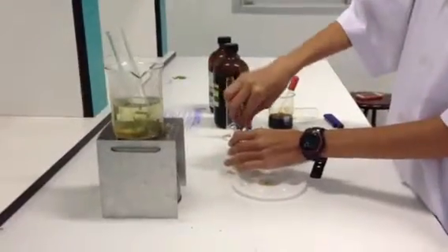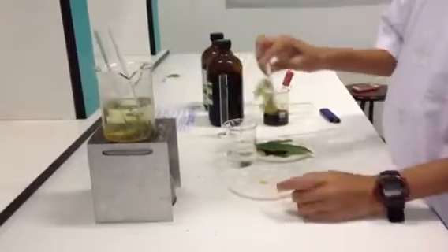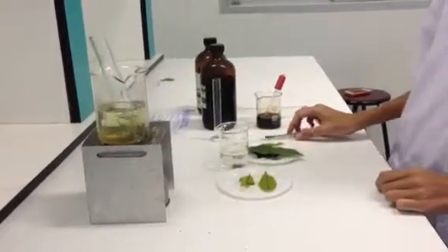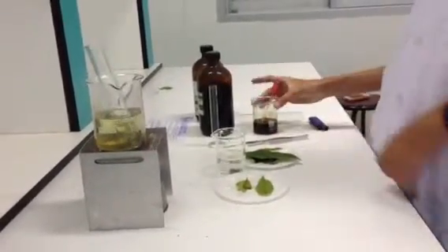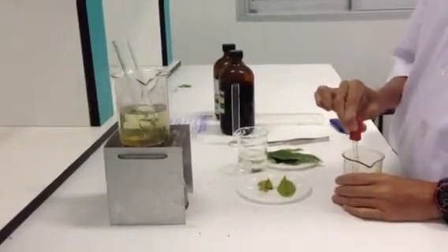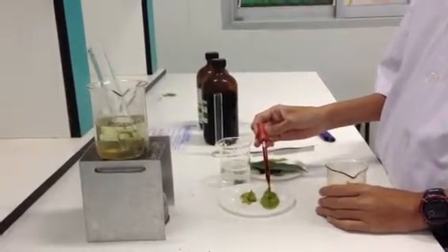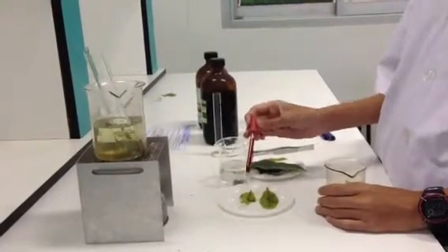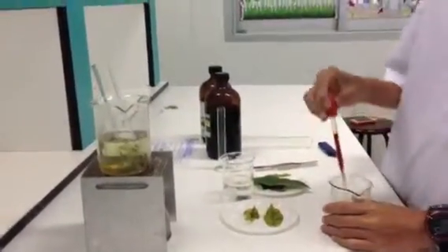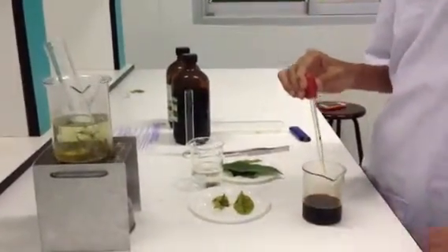Take out the leaf and dry with a paper towel. Place the leaf face down and drop iodine solution — one, two, three drops. Wait for color change.